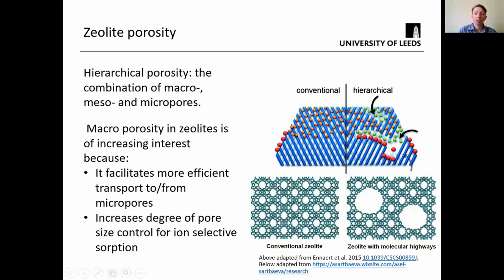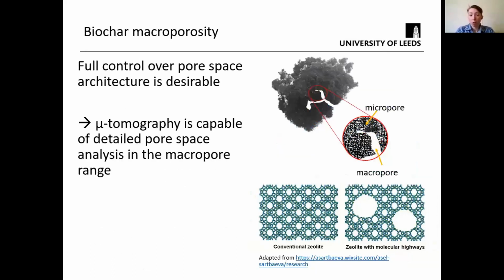As you can see here in these recent images, they're termed molecular highways, the larger pores, for facilitating transport to the micropores. I would argue that if biochar-based materials are to rival synthetic zeolites and other inorganic materials, this degree of pore size control and tunability via activation methods should be striven for as much as can be. And this is my motivation for studying the macropore architecture in activated biochars.